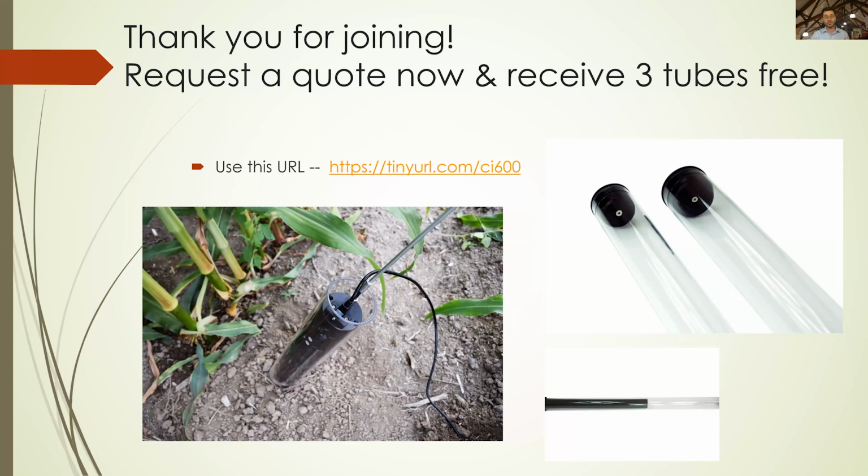Once it's actually installed and you make sure that there's no water and the installation cap is on, you should be able to use that tube repeatedly pretty much as long as it's clear. If you do get water into it and say like you have a standing amount of water, I definitely highly suggest don't put the 600 or 602 in there. That will likely damage it. It's kind of hit and miss. And what we do suggest is make sure that you drain out that tube if you're going to continue using it.